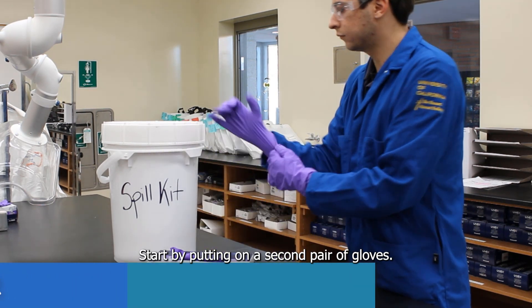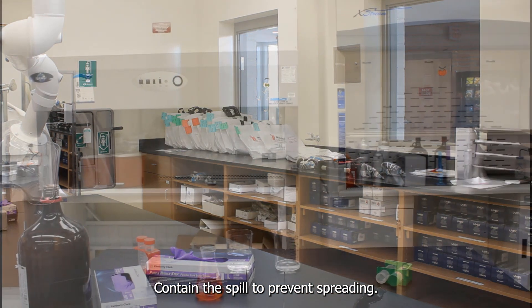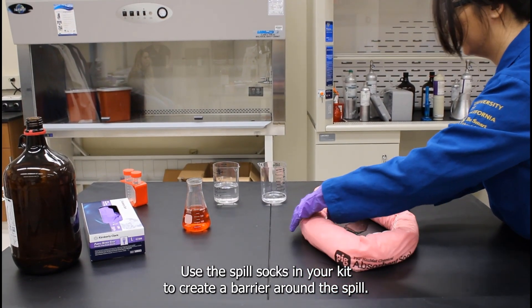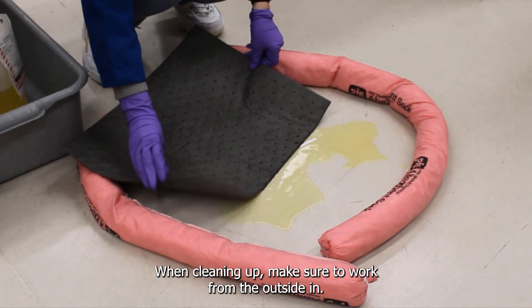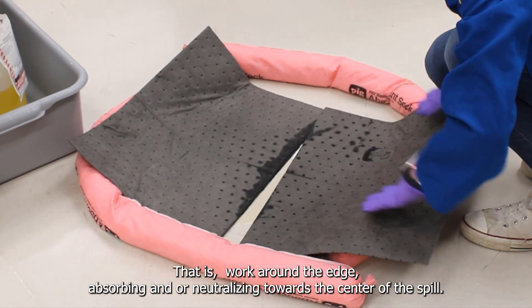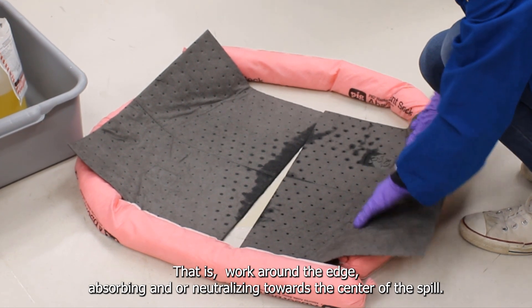Start by putting on a second pair of gloves. Contain the spill to prevent spreading — use the spill socks in your kit to create a barrier around the spill. When cleaning up, make sure to work from the outside in, working around the edge absorbing and/or neutralizing towards the center of the spill.